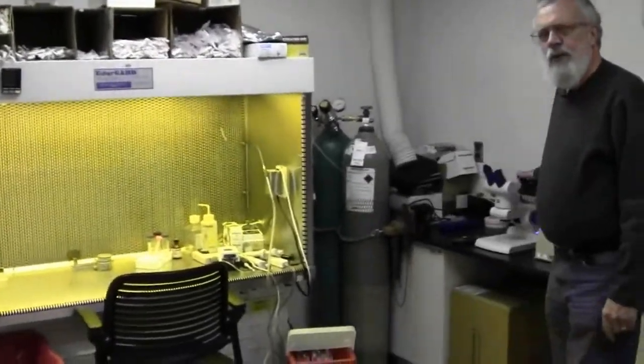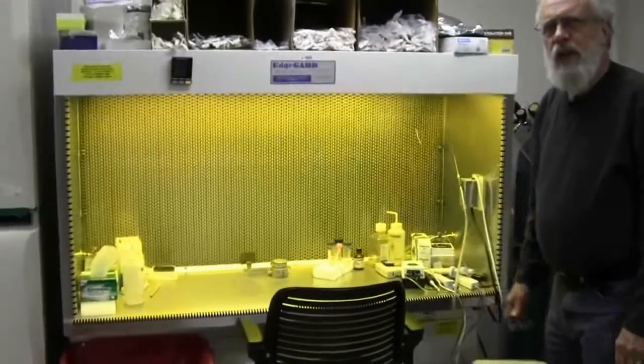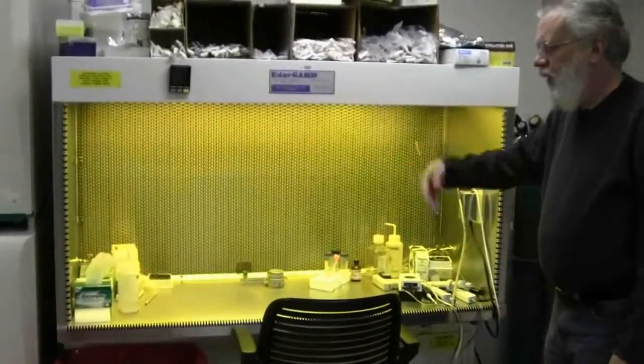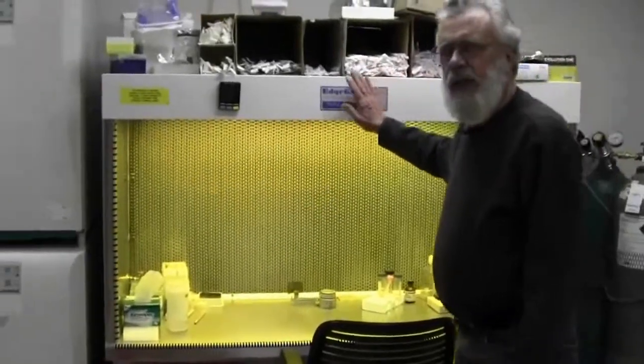We have microscopes they need to check on the condition of the cells. We have the lab bench where they clean the area that they can work with the cells. We have the material that they need for doing their experiments.